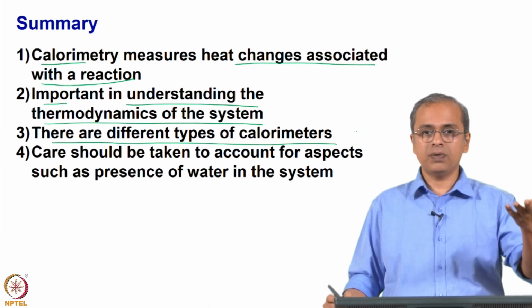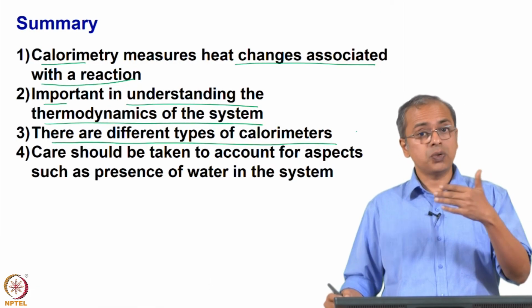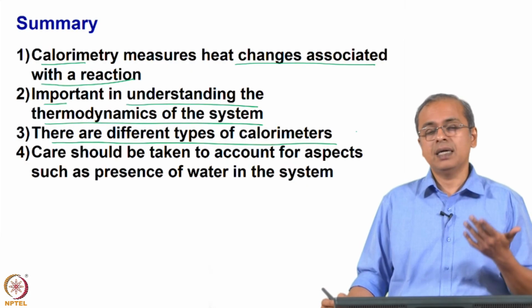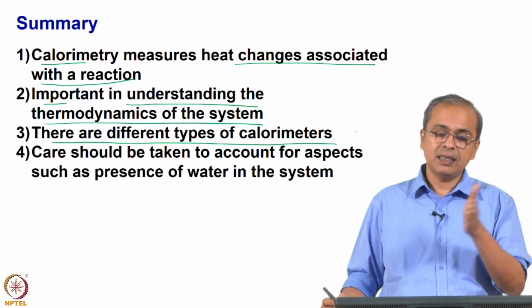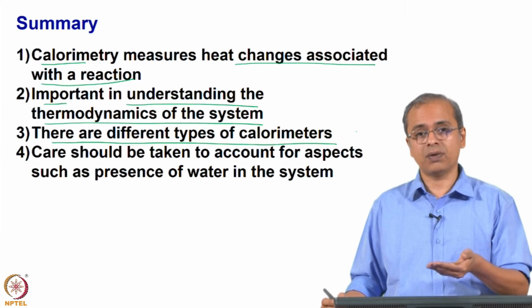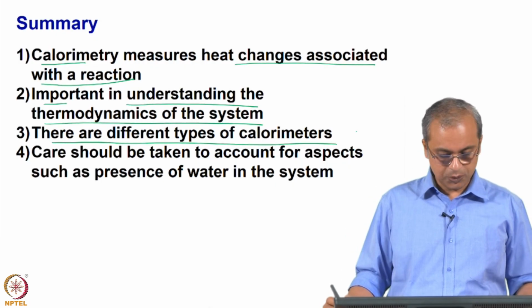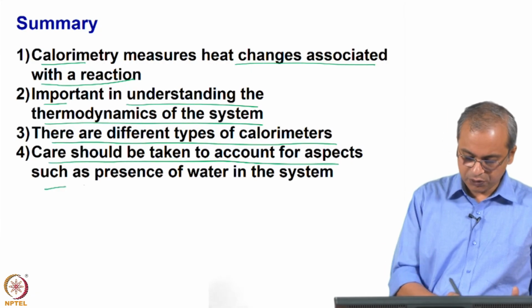So, there you are already talking of systems that require much higher temperatures where we will see phase changes. So, if you are trying to compare different phases of the system, say, the relative stability of those phases, then you need to have a calorimeter which can operate at those higher temperatures for you to see the relative stability of those different phases, make some measurements first of all about those relative phases, and on the basis of those measurements make some judgment. So, that is why you need those calorimeters such as the drop calorimeter and drop solution calorimeter.